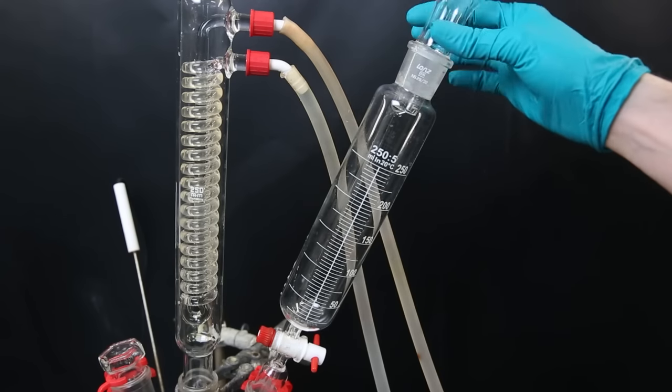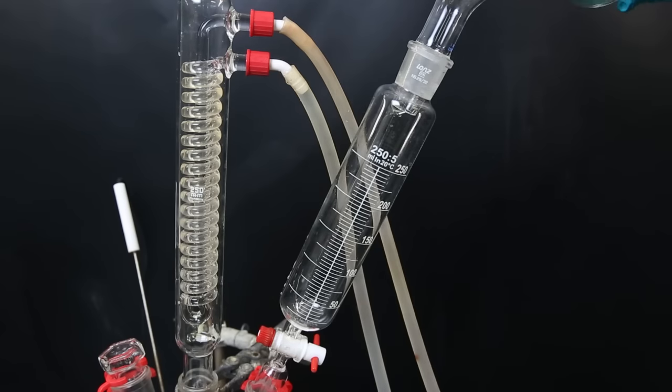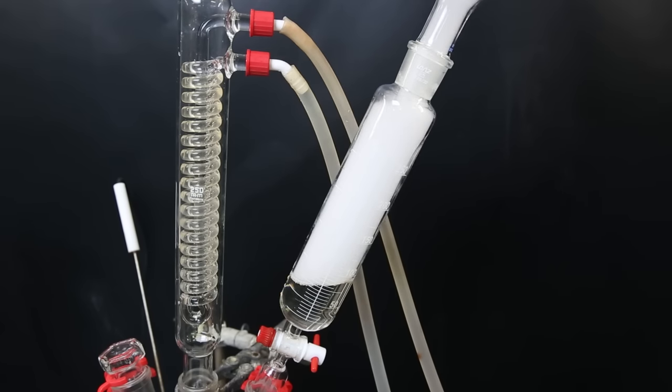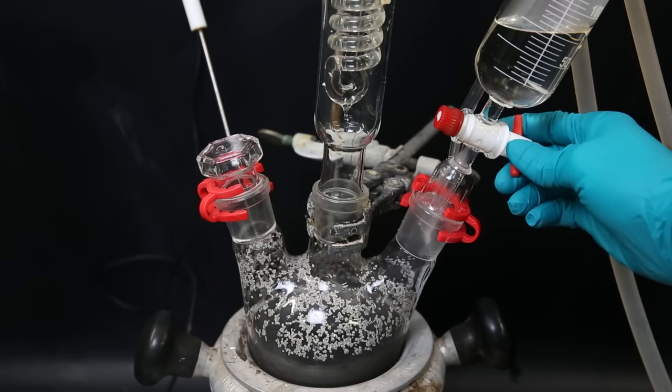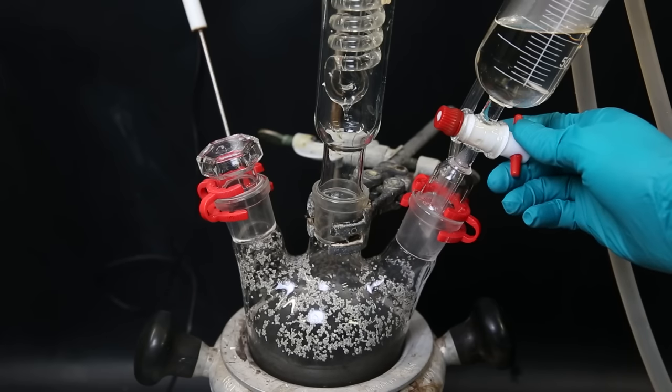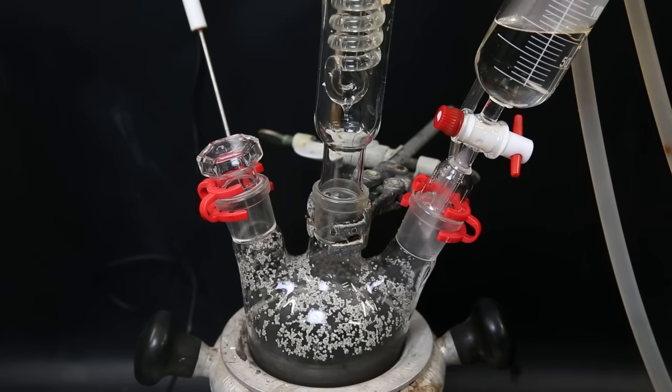Now to the dropping funnel, I quickly add in the tin 4-chloride toluene mixture without bothering to do it with a syringe. I stopper it again and then slowly start dropping the mixture into the reaction flask. I add it at such a rate so that it is refluxing normally.